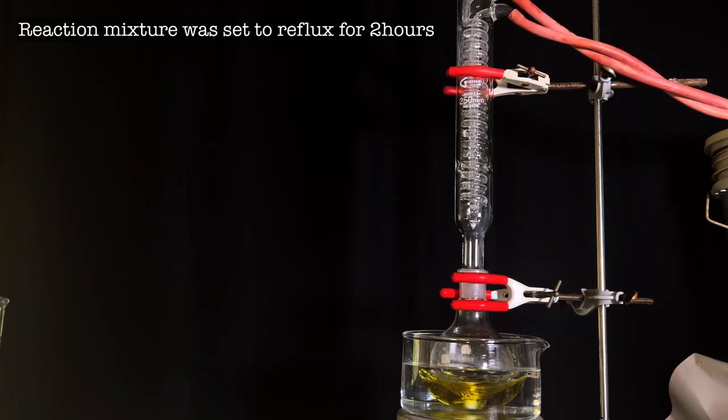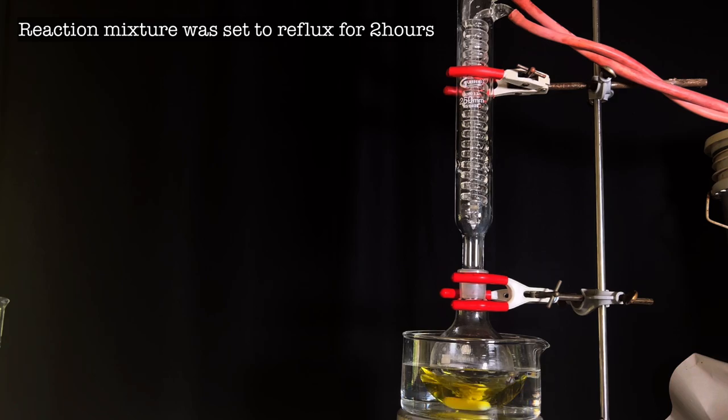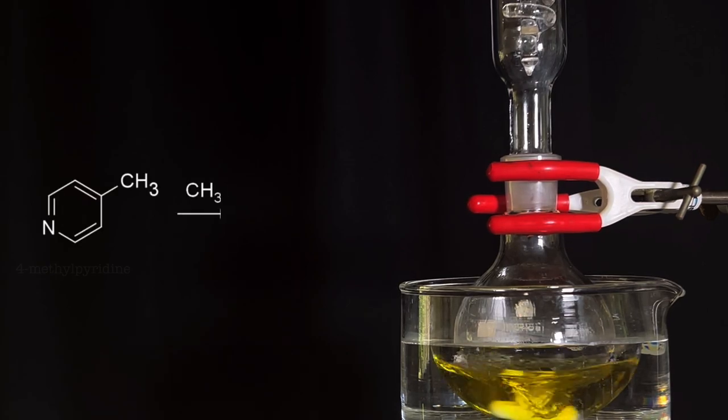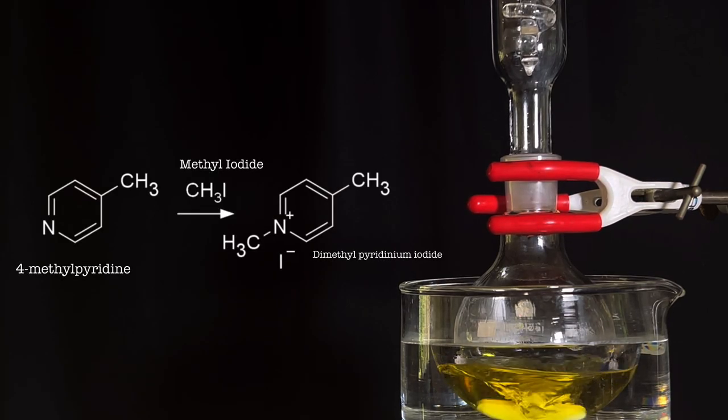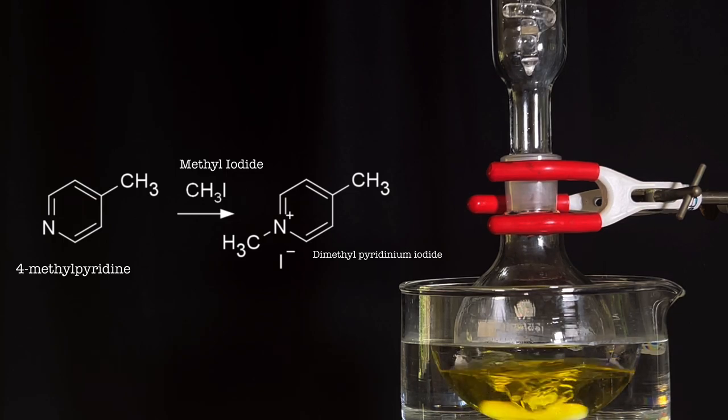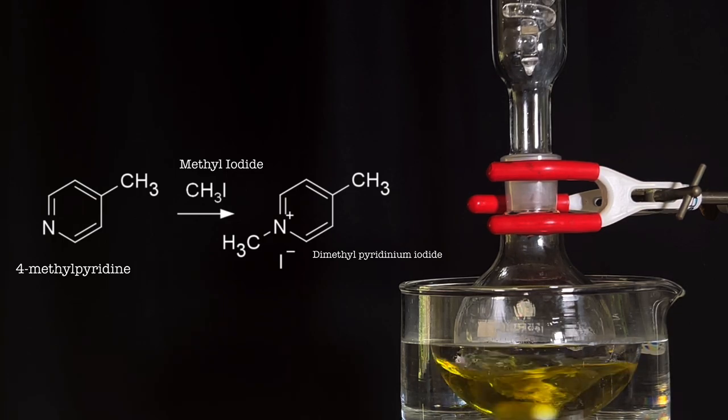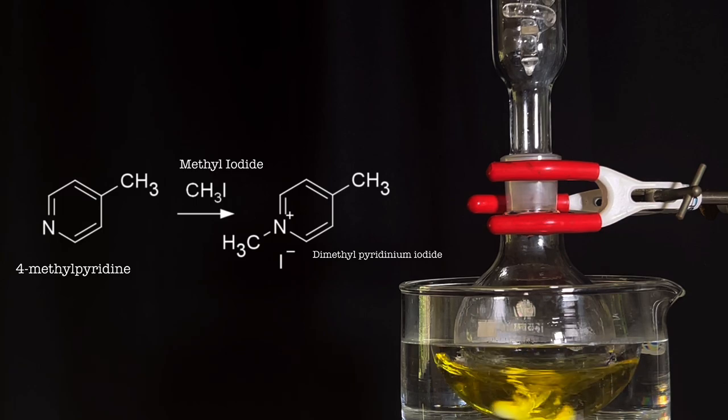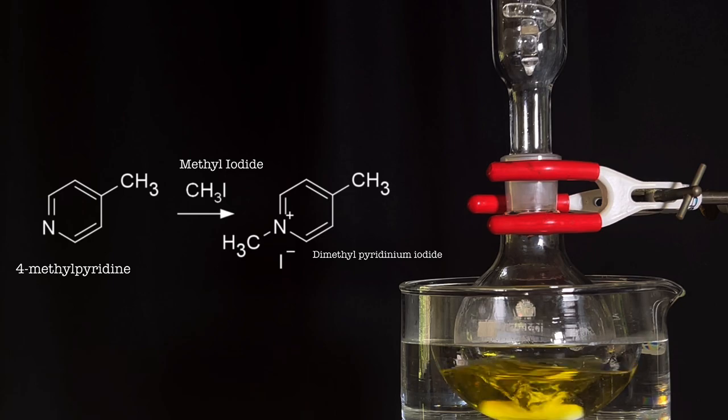A dimroth condenser was attached on top of the reaction flask and the flask was immersed in a boiling water bath. The contents of the reaction flask is set to reflux for 2 hours. Now let us see what is happening here. Here, the 4-methylpyridine is methylated by iodomethane which is one of the best methylating agents. This gives rise to 1,4-dimethylpyridinium iodide which is the intermediary product which we need to collect for continuing with the next step of the synthesis.